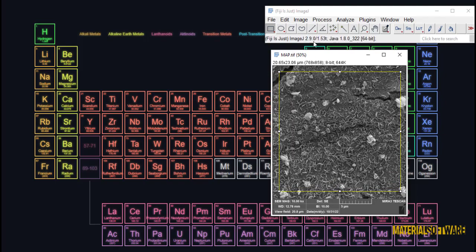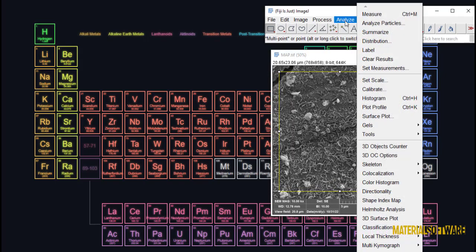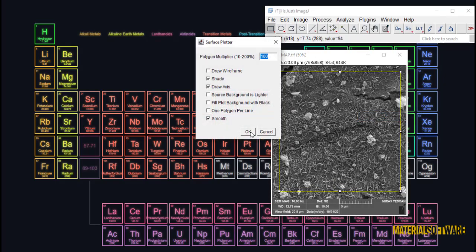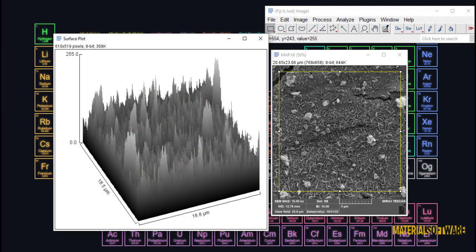Now go to the Analysis tab and select the Surface Plotter option.